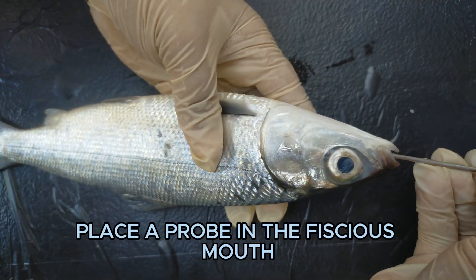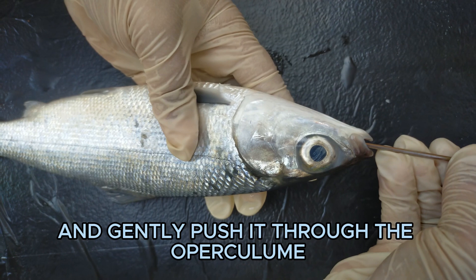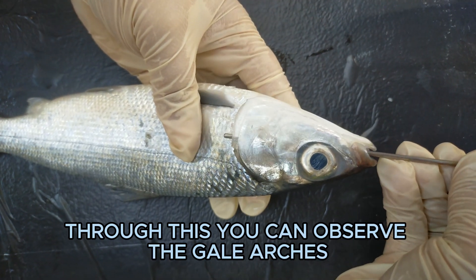Place a probe in the fish's mouth and gently push it through the operculum. Through this, you can observe the gill arches.